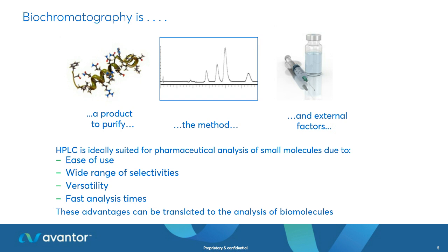So HPLC is very well suited to biopharmaceuticals. It's a really well-established, well-understood technique, and it will work for the vast majority of proteins and peptides. So all of the great development that we've done on small molecule HPLC, we can translate to biological molecules.